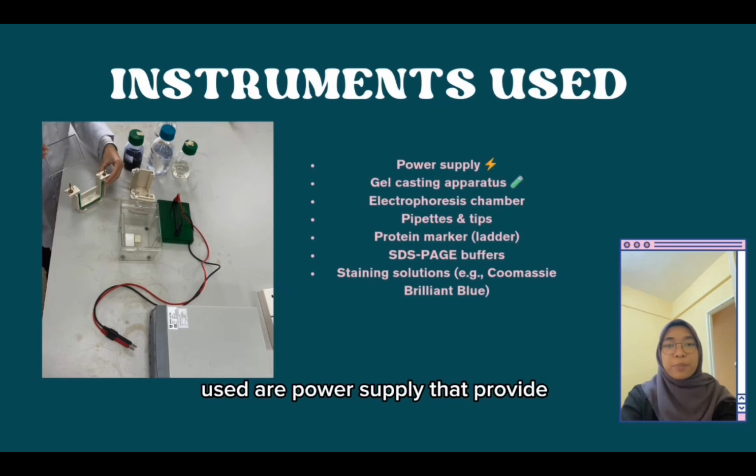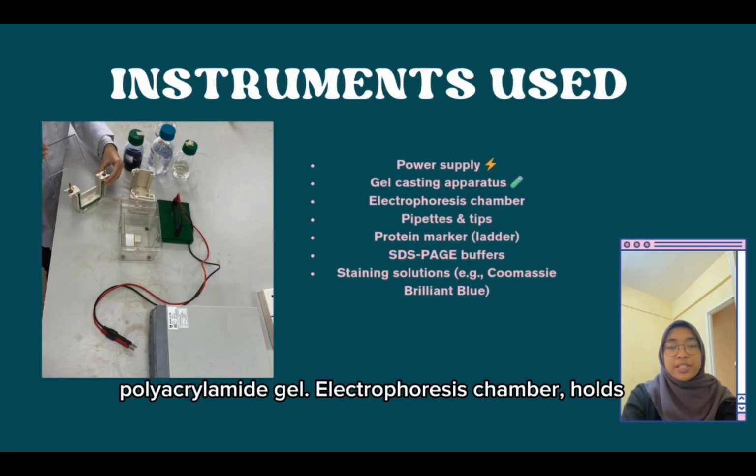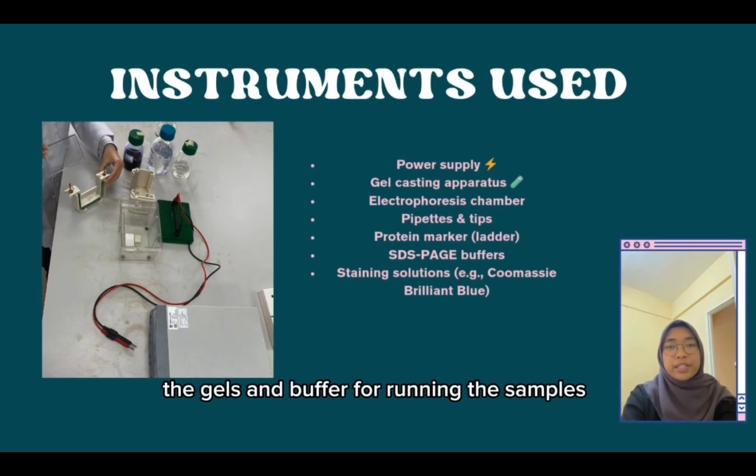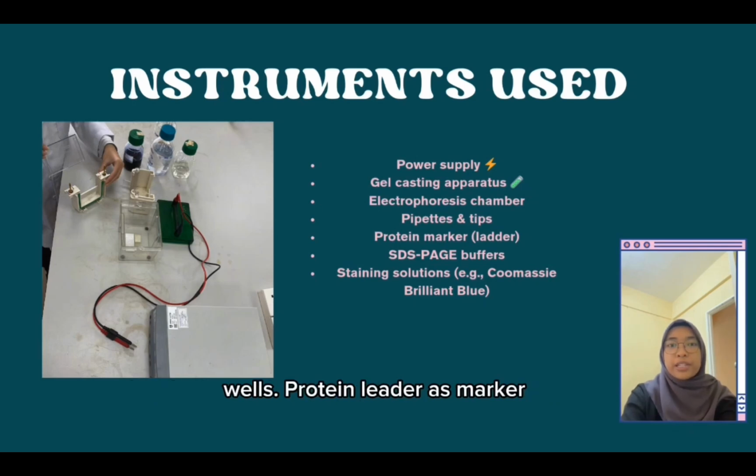The instruments used are a power supply that provides an electrical current to move proteins, a gel casting apparatus used to prepare the polyacrylamide gel, an electrophoresis chamber that holds the gels and buffer for running the samples, and pipettes and tips used to load protein samples into the gel wells. The protein ladder serves as a marker, a reference for estimating protein size.